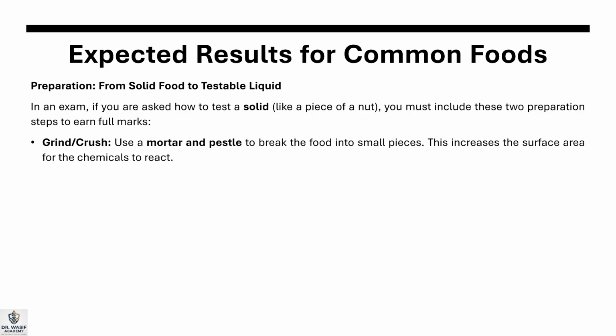Number 1 is grind and crush. Use a mortar and pestle to break the food into a fine mush. This increases the surface area, ensuring the chemicals can actually reach the molecules inside.